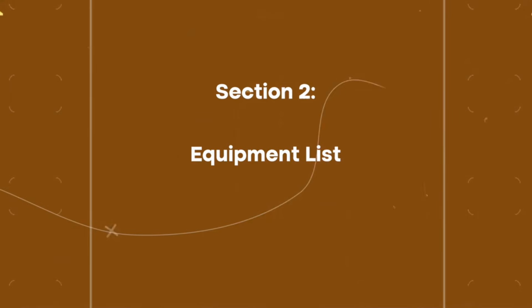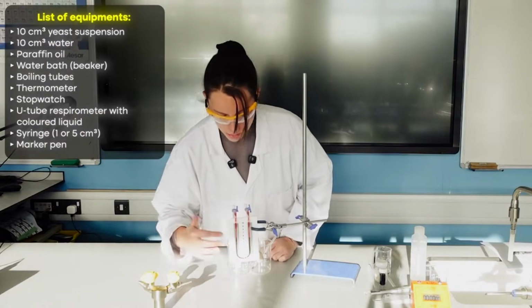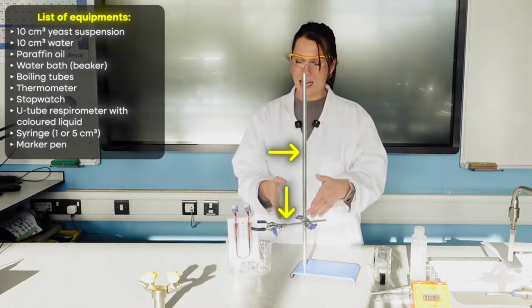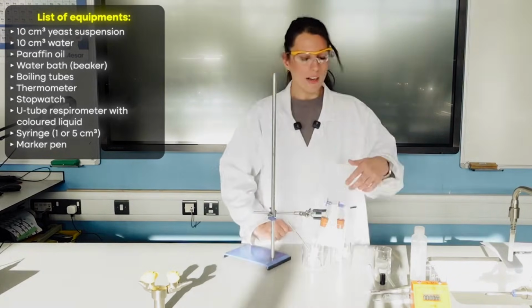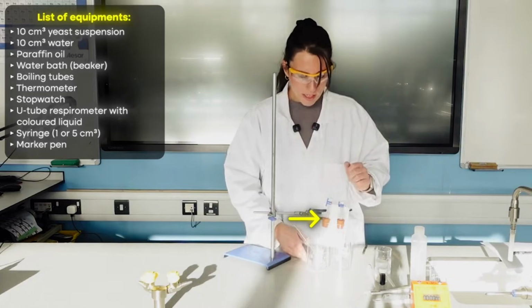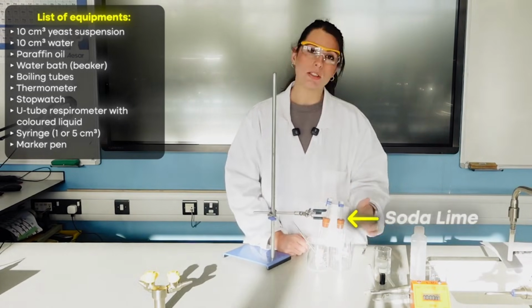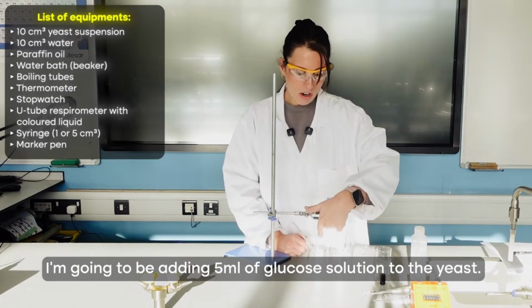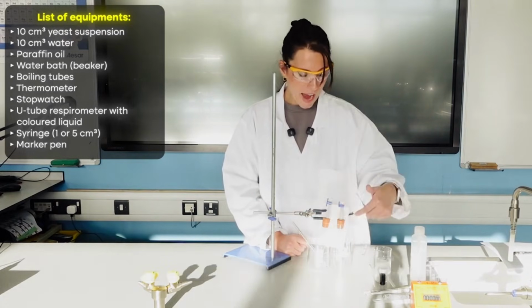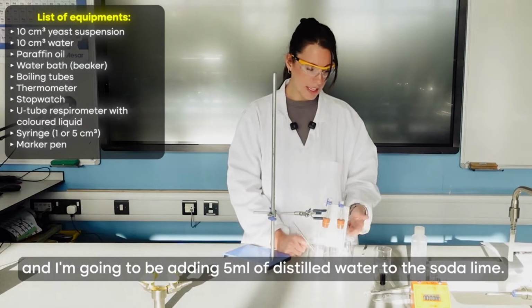So what you have here is your manometer, which makes up the pressure chamber part of your respirometer. I've got a clamp stand and clamp holding this in place. And then on the other side of this, I've got my 2 boiling tubes. This one here has got yeast. This one here has just got soda lime. I'm going to be adding 5 millilitres of glucose solution to the yeast, and I'm going to be adding 5 millilitres of distilled water to the soda lime.